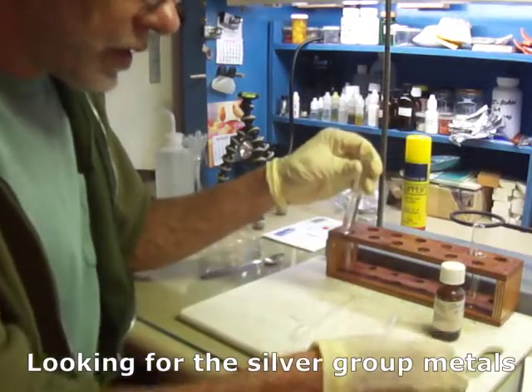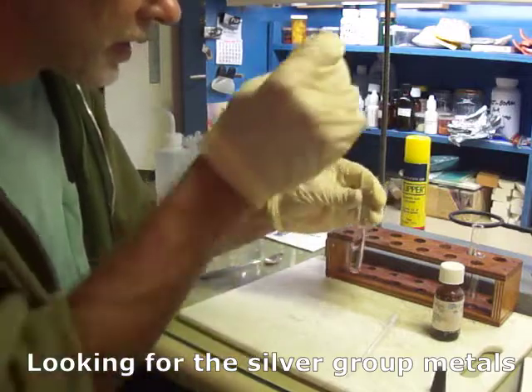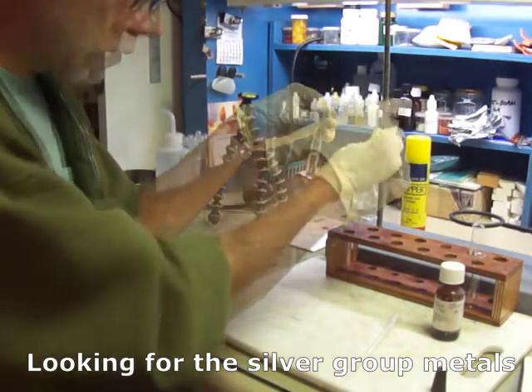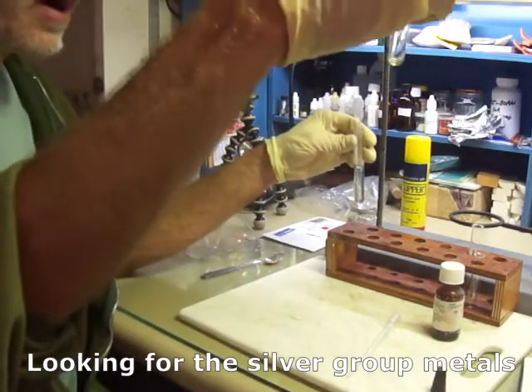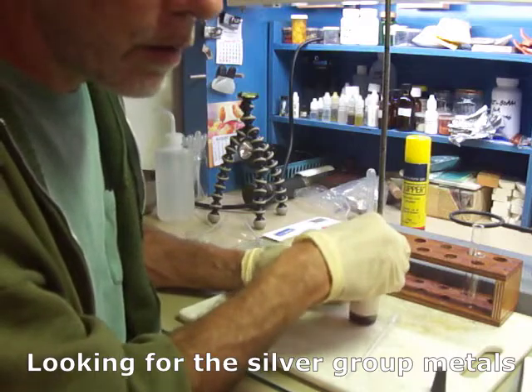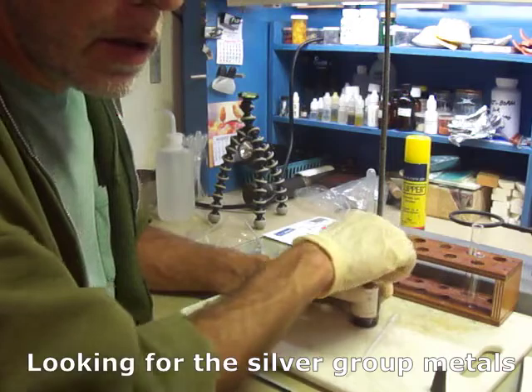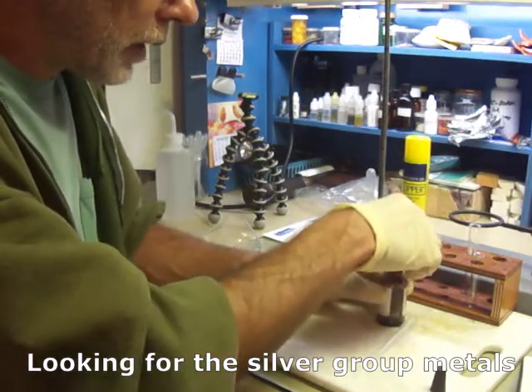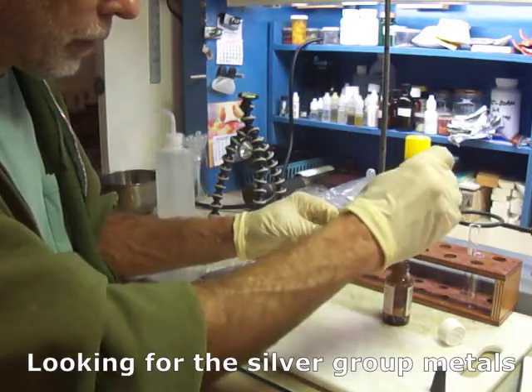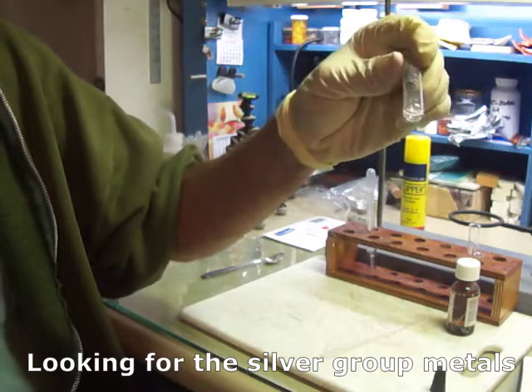So, according to the procedure, it is really semi-micro. You only use about 5 drops of the solution. So I'll steal that. Alright, that's 5 drops. Holy cow. And you're supposed to add 2 drops of 6 molar hydrochloric acid. I'm too lazy to dilute it. Concentrated is about 12 molar, so I'll just add 1 drop. And we have absolutely no precipitate.